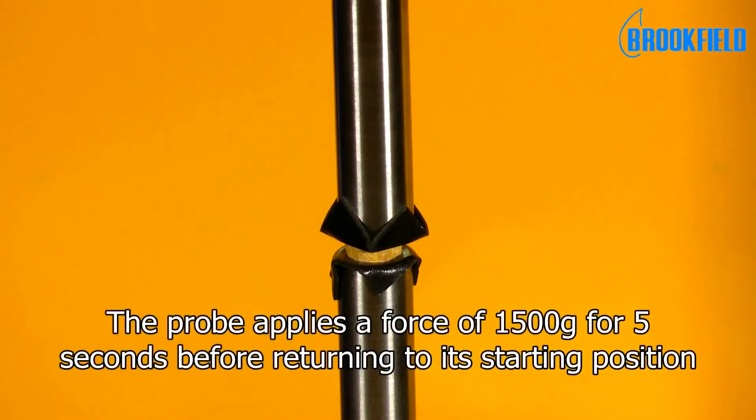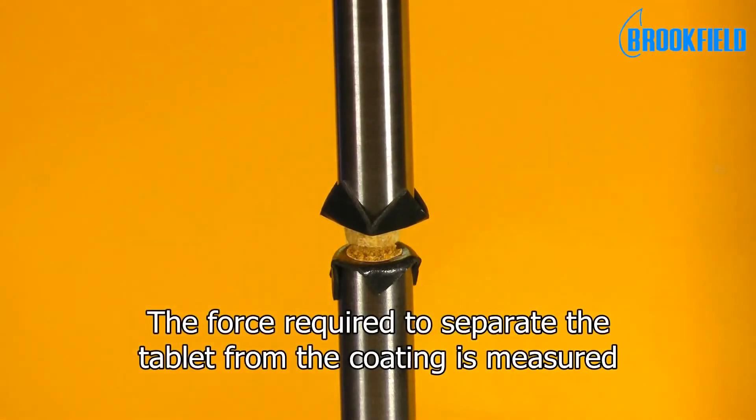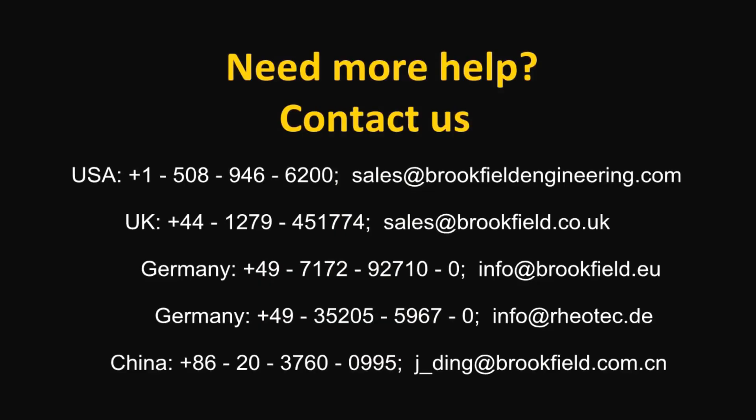Here the probe applies a force of 1500 grams for 5 seconds before returning to its starting position, and the force required to separate the tablet from the coating is measured. If you need further assistance, please contact us.